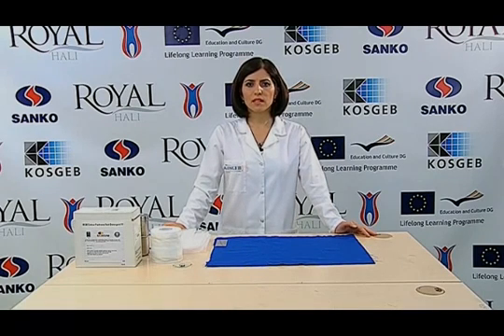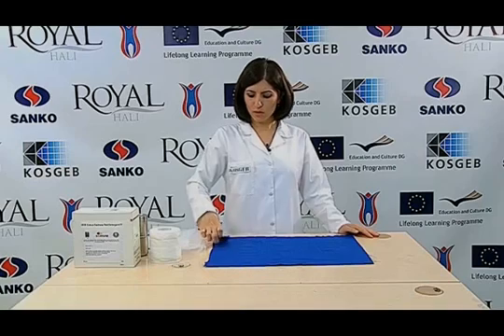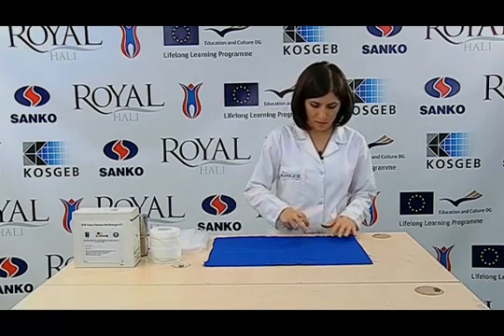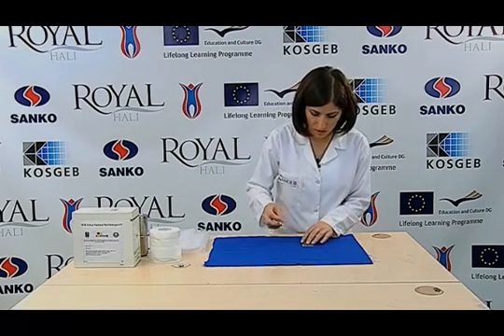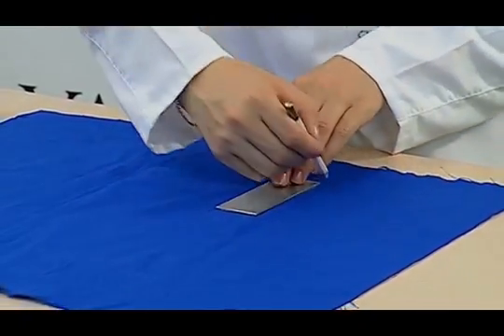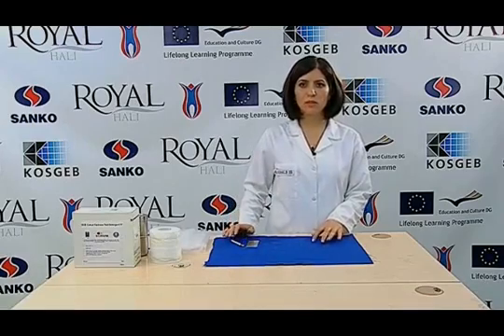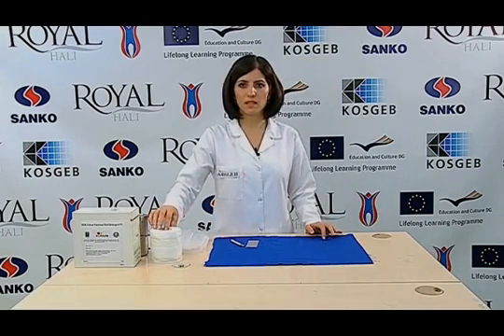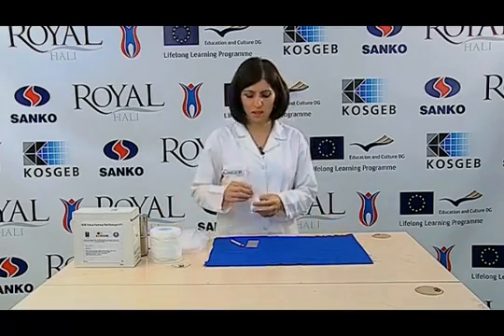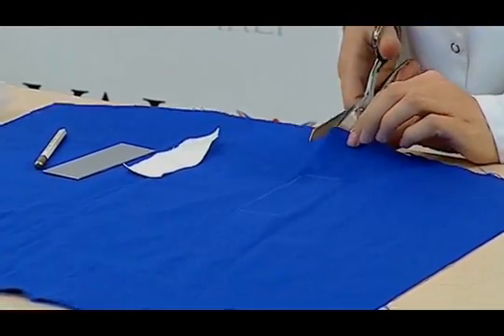To prepare the test sample for the test, it is marked with a template of 40 mm by 100 mm, 15 mm away from the selvages if the sample is fabric. A multi-fibre adjacent fabric is prepared at 40 mm by 100 mm in size. The test sample and the prepared multi-fibre adjacent fabric are sewn face to face along the short edges.